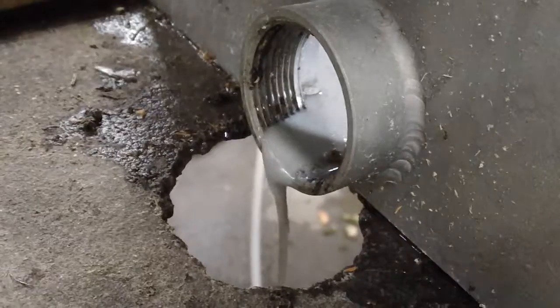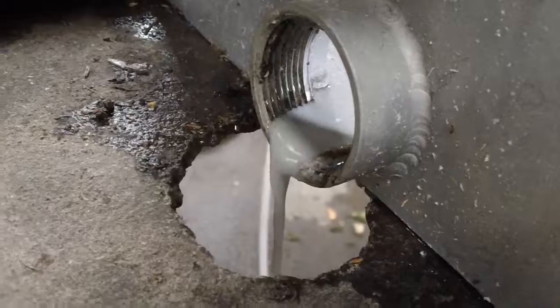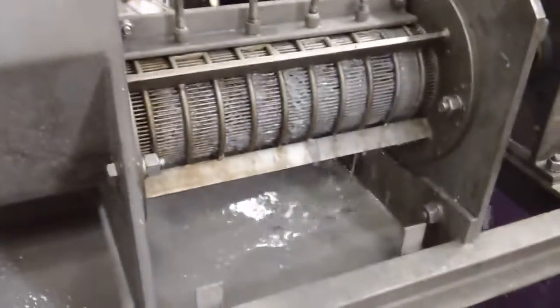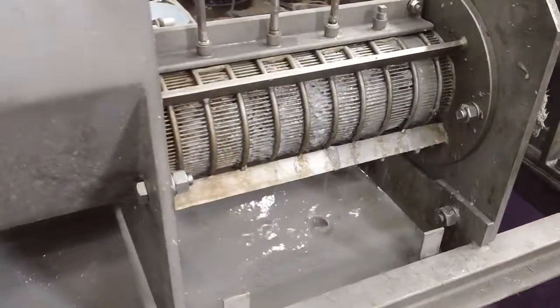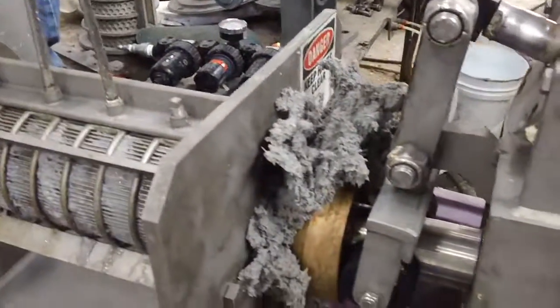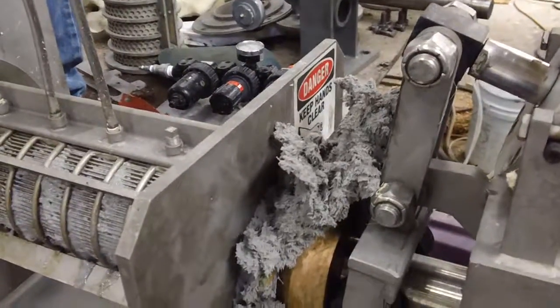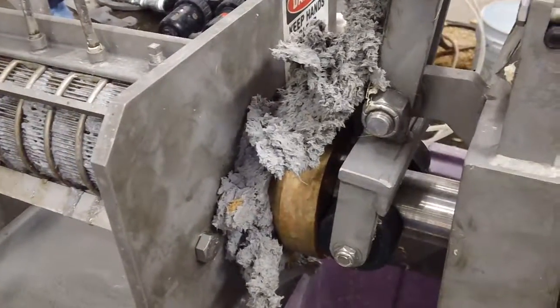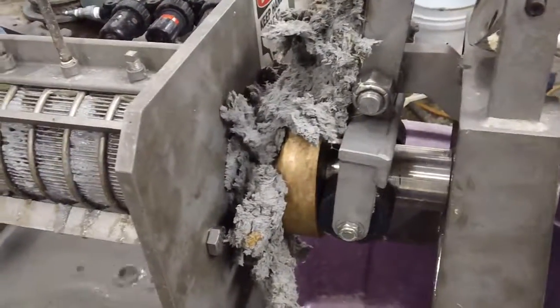But we are creating a flow of press liquor. I'll catch some of that press liquor here in a second. It's creating a nice press cake for sure. This press can handle much more than 20 PSI, but we want to run this test at a pressure that allows us to duplicate the results with larger machines.